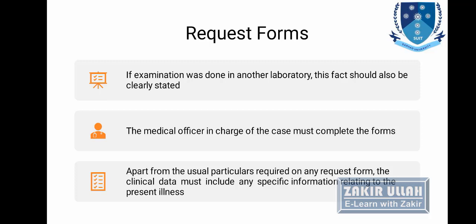All this information should be filled in, and the request form should be filled by the medical officer or the person in charge of the case, because it is the duty of that medical officer to make sure that all the required information is written in the request form.